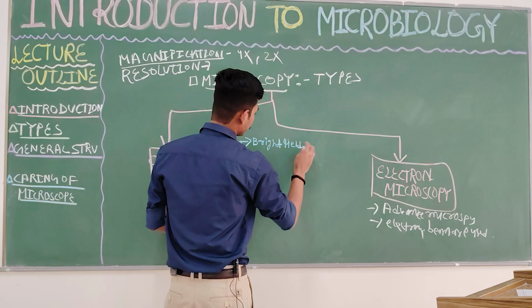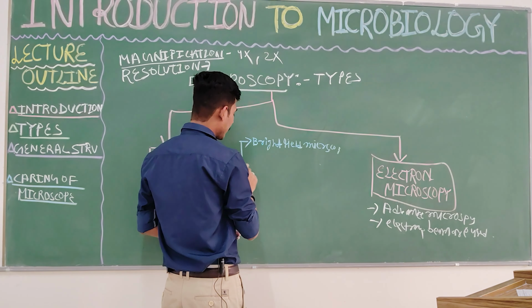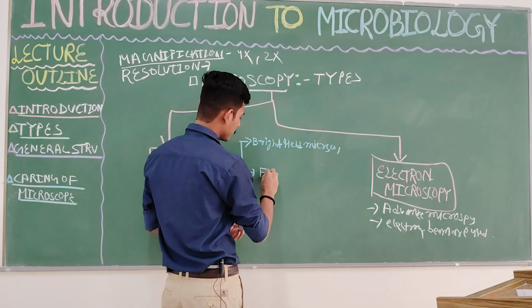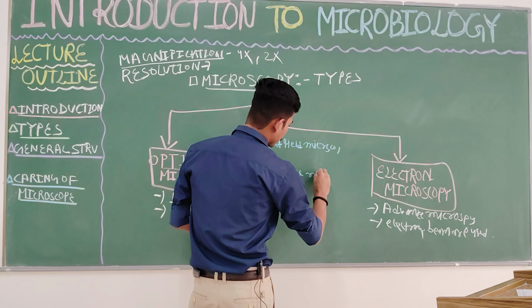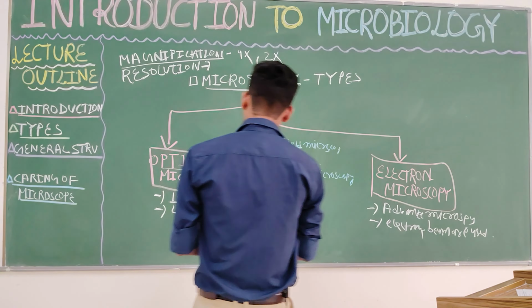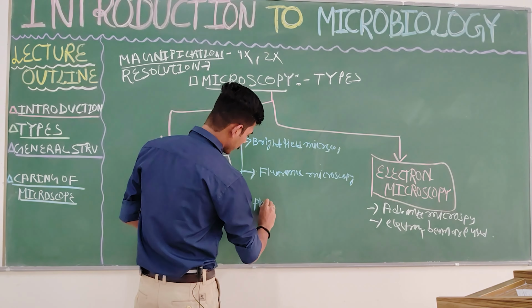Now another type is called fluorescence microscopy. And another one is called phase contrast microscopy.